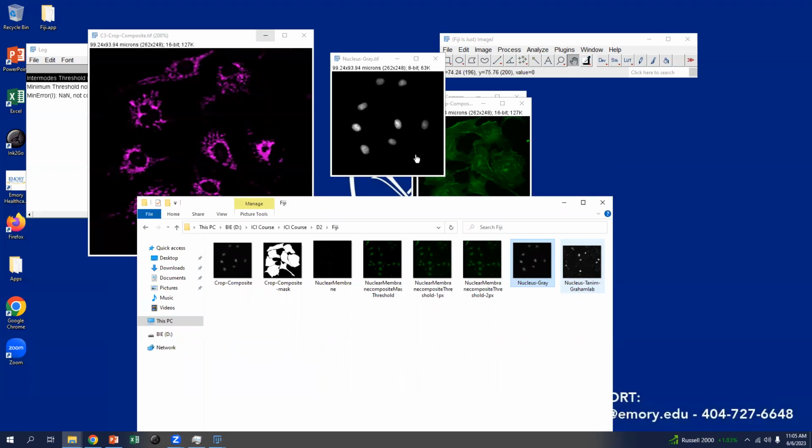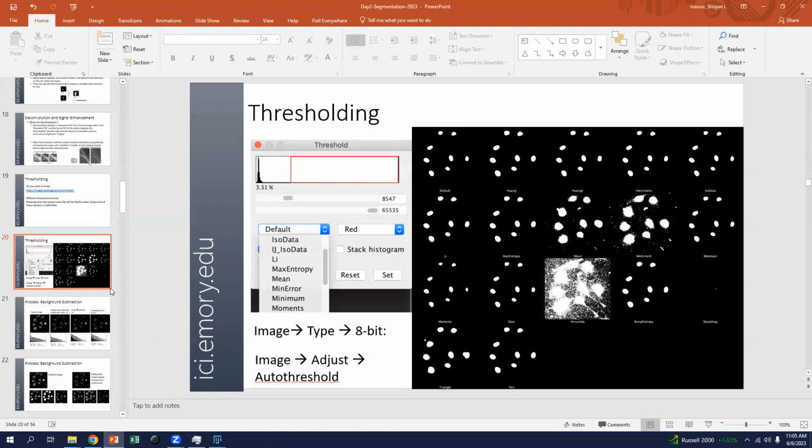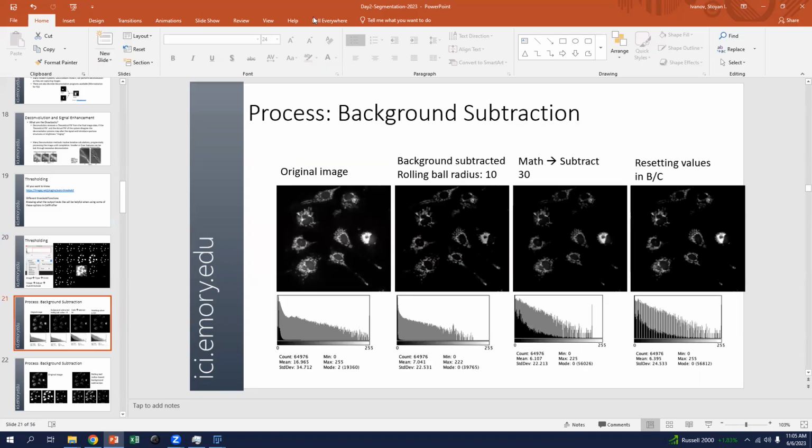The issue we saw as I was running it is the larger the image and the higher the bit depth, the longer it can take to process. So if you're running it and it's taking forever, you can always crop out a section that has some representative noise and some representative signal, and then threshold that and take it as a baseline. Because if it works on the cropped segment, it should work on the whole image. All right. So that was the auto threshold function.